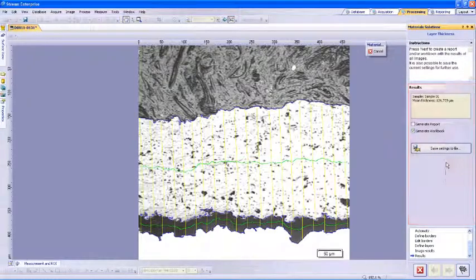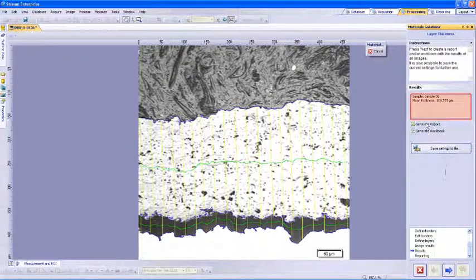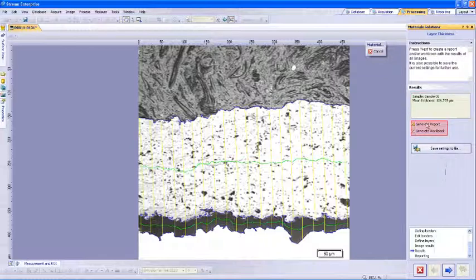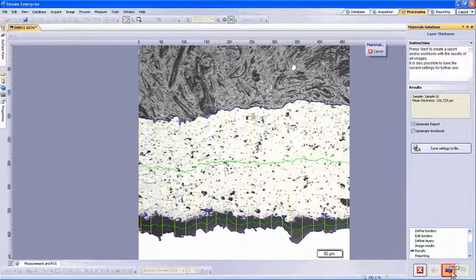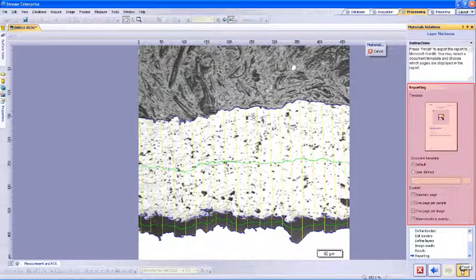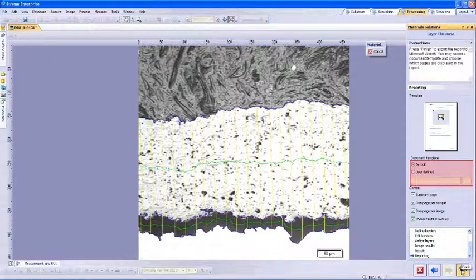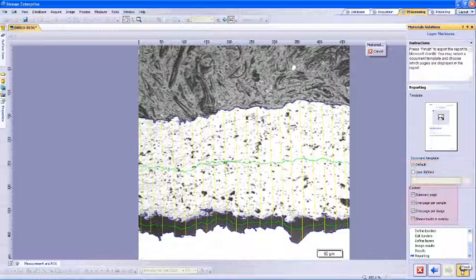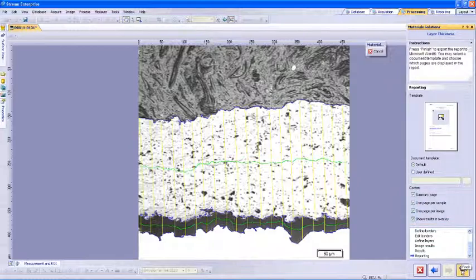Within results, we will see the mean thickness value for all of our selected layers for this sample, and we have the ability to select to generate a report and a workbook. We will select both here and then click the next arrow. Since we selected to generate a report, this will now take us to the Reporting window and will allow us to select either the Default Template or User Defined Template. We can also define the content of the report below. We will leave all of the default values selected here. Click the Finish button to complete the report and generate the workbook.